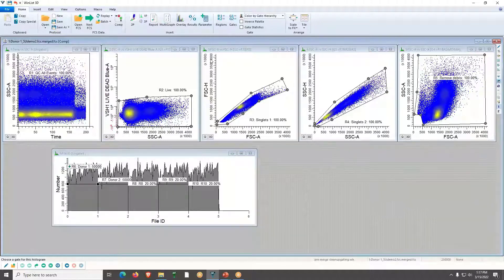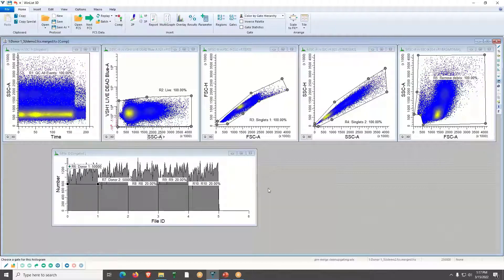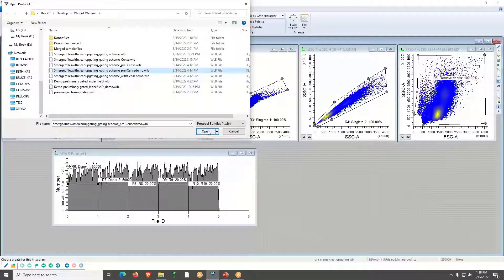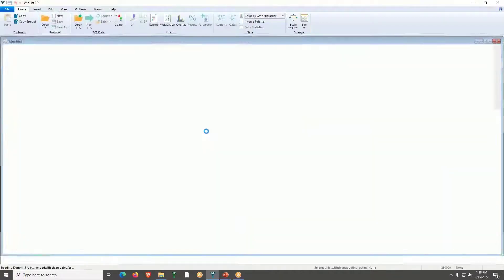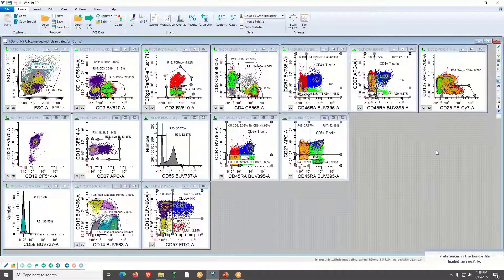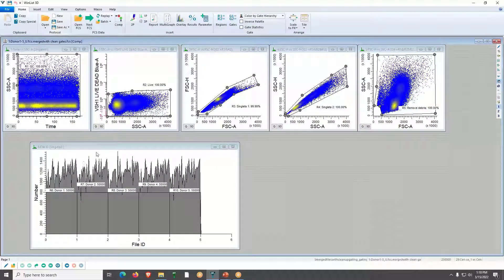I'm not going to go through each one now — I just wanted to show the method. What I would normally do next is set up some histograms for an overall gating scheme, but to save time I'll open a protocol bundle I've previously created that already has the gating scheme in place. I'll click on the bundle that includes the merged file.